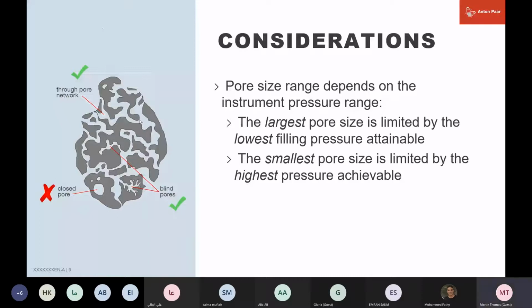So the pore size distribution that we measure is sensitive to the entire network, how the pores are connected, whether larger pores are behind smaller pores. I'll draw your attention to this pore body, more or less in the center of the particle here, which is only accessible through, well, we have to find a connection to the outside world, these three pores here.